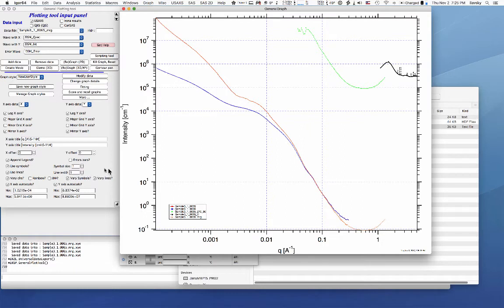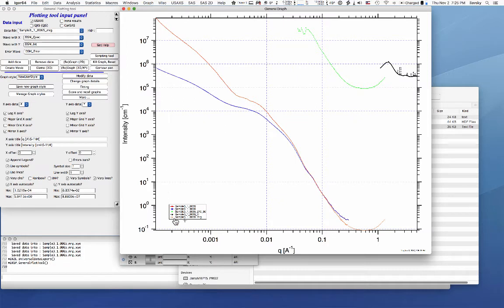So actually USAXS plus SAXS together will get you one, two, three, four, five, six, seven, eight, nine decades in intensity, over four decades in Q. It's actually very cool in the results.